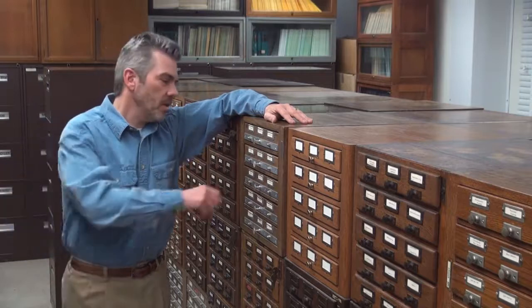I'm a research entomologist with the USDA's Systematic Entomology Laboratory. I'm standing beside one of the world's largest collections of microscope slides of aphids. Each one of these drawers contains hundreds of these slides. However, there are other arthropods that are also prepared on slides. Today I'm going to show you how to make a slide of a soft scale, family Coccidae, for examination or identification purposes.